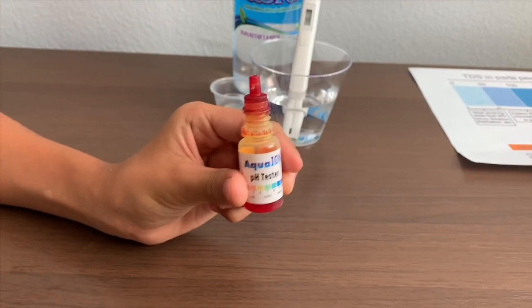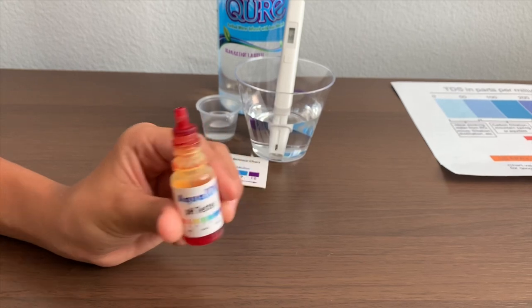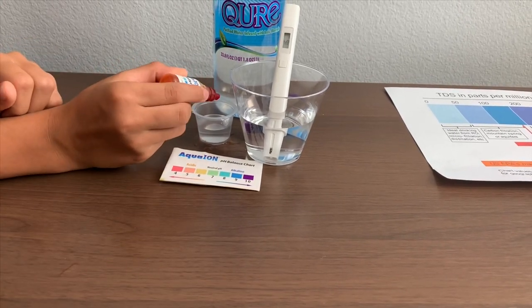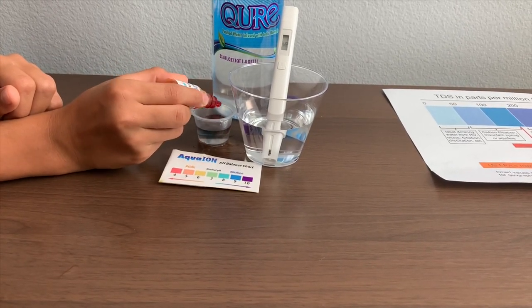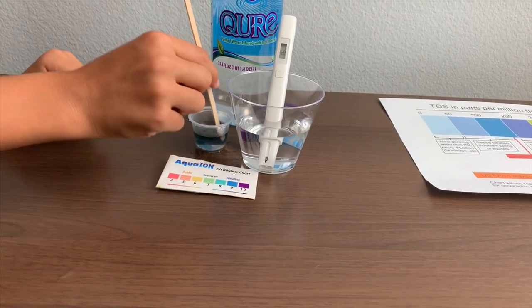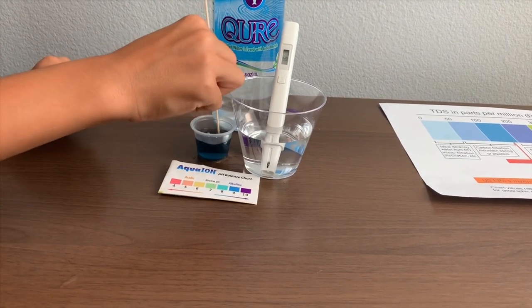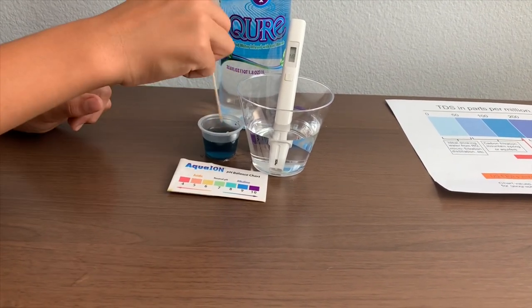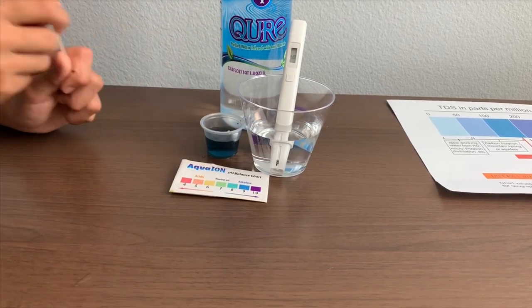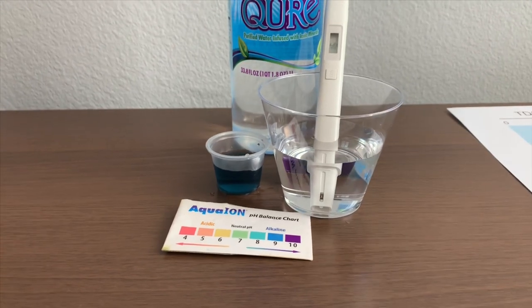Now let's test the pH level. If you want to buy this pH tester, check the link down below. Make sure you do two drops only. Let's stir it in for a better result. I'd say that is an 8.5 — that is alkaline water.